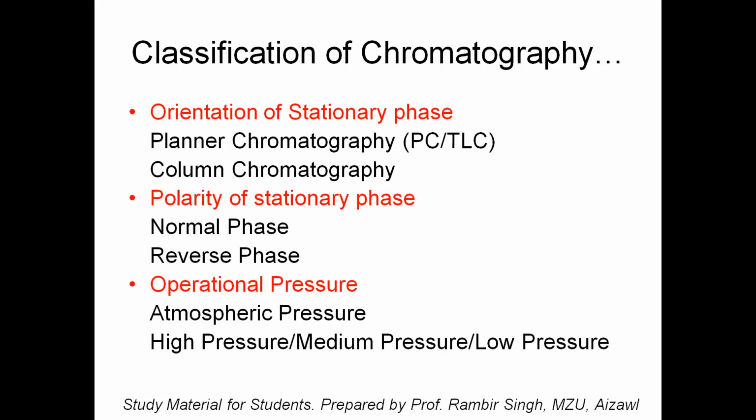Okay. So when we started using, say, silica for separation, if you separate, say, chlorophyll on silica, it is a very good combination, because chlorophyll molecules are non-polar in nature. You have silica as polar, and you can always use a non-polar solvent like chloroform, petroleum ether, or hexane as a mobile phase on this chromatography.